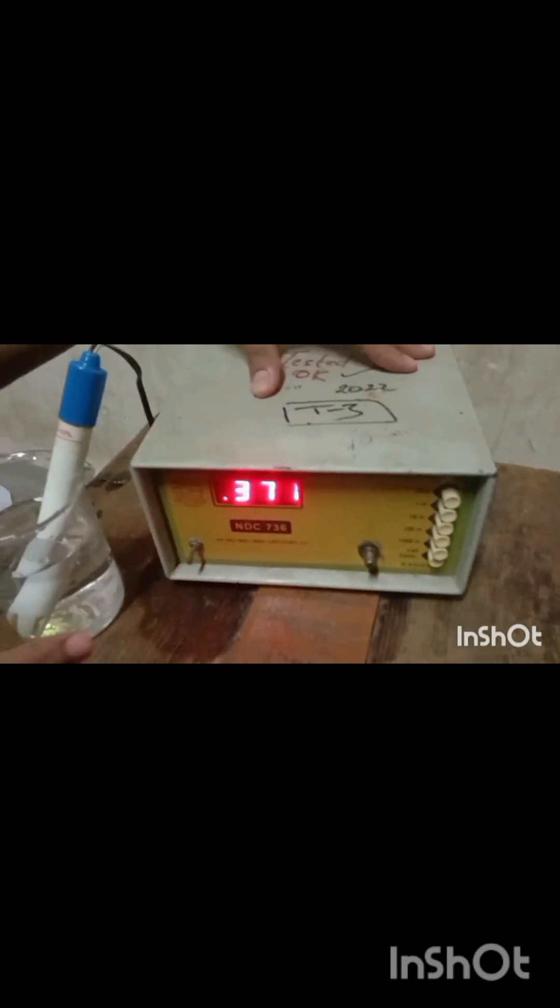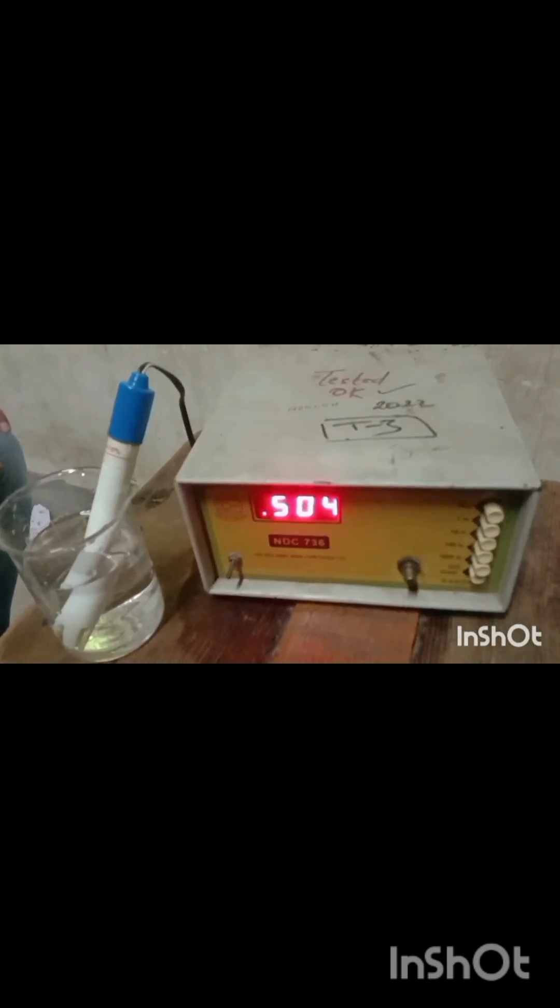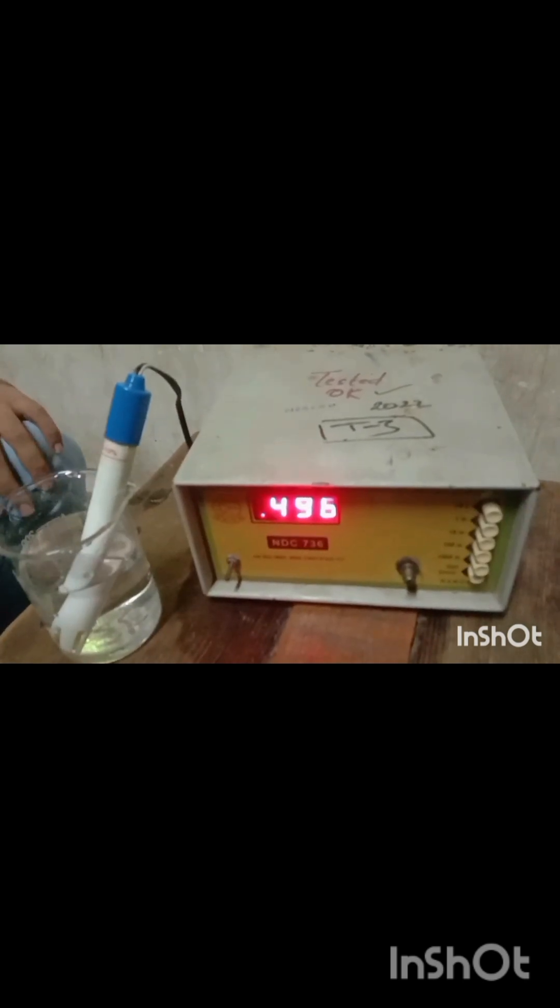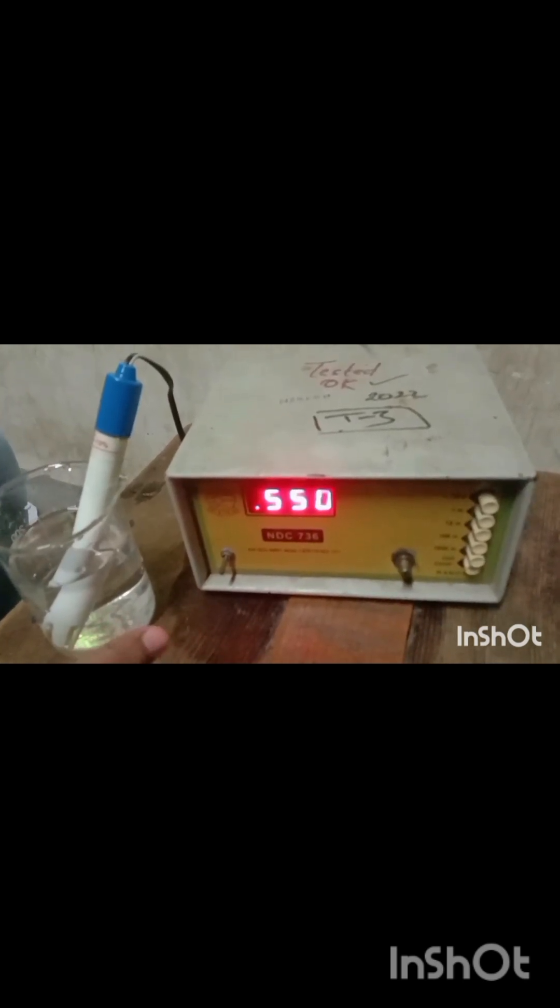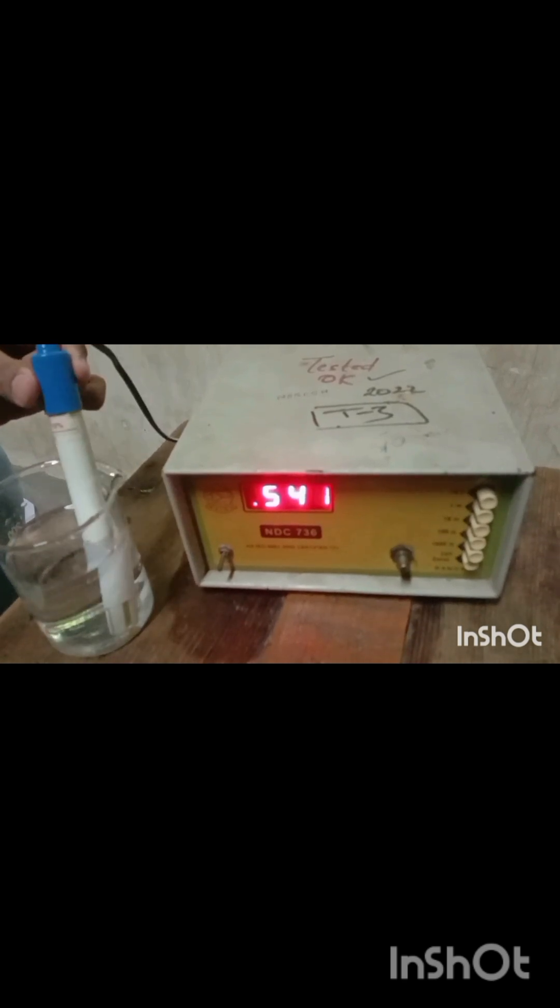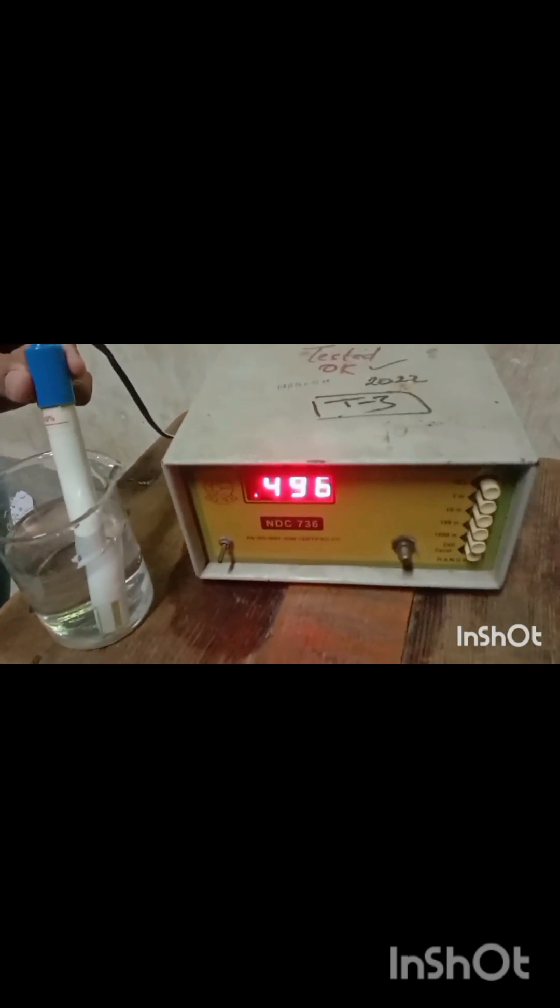Then we switch on the instrument, our conductometer. By dipping the conductivity cell in the 0.1 normal KCl solution prepared above, we note the reading displayed in the digital conductometer. The stable reading comes out to be 0.566.